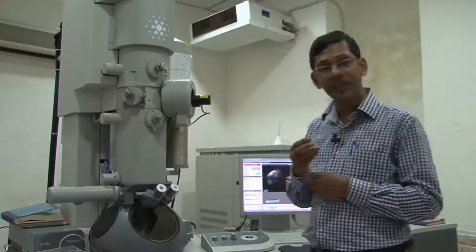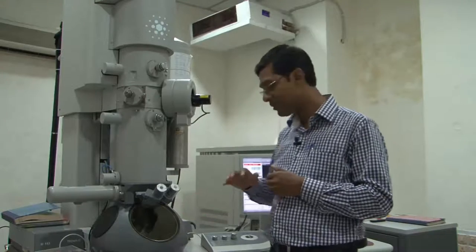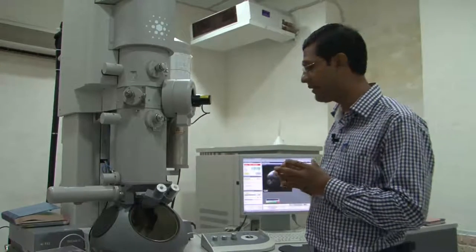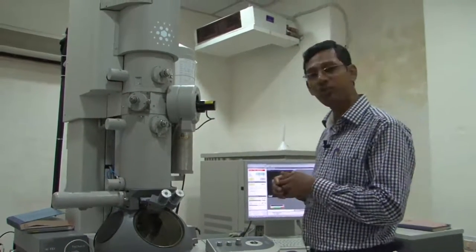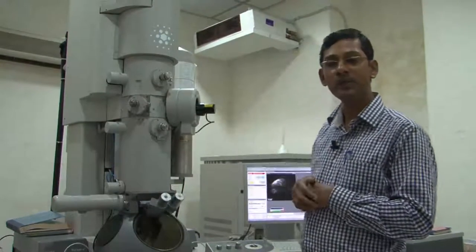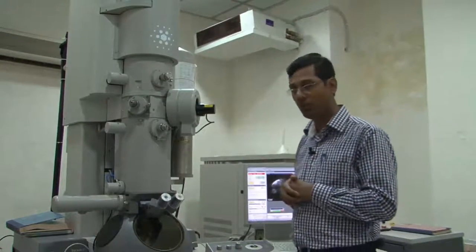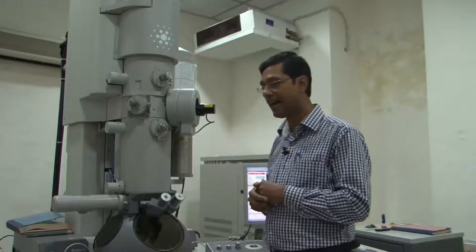cannot move. By doing so, you can create problems in the image, because the vibration generated by that can reduce the resolution of the microscope. That's why those microscopes are remotely controlled. You can insert the sample, then go out to a separate room and control it remotely. But here that's not the case, because the resolution of this microscope is not that high.